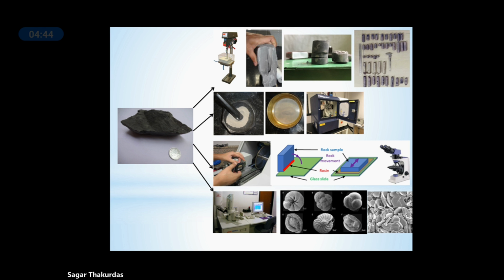So the same sample, as I have told you previously, can be used for different analyses, and this will help you in characterization of any rock. Now, in this particular case, we have gone for shale rock characterization. If you are going for any other rock like sediment, sandstone or carbonate, the methodology will differ. So that is an important thing that you have to remember.